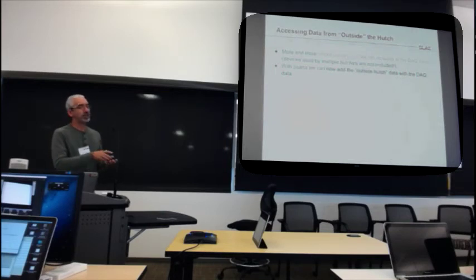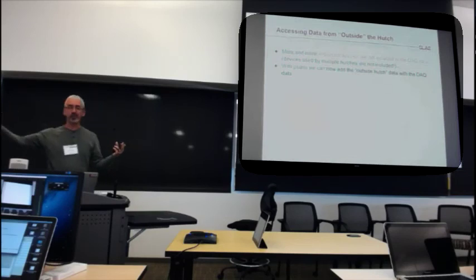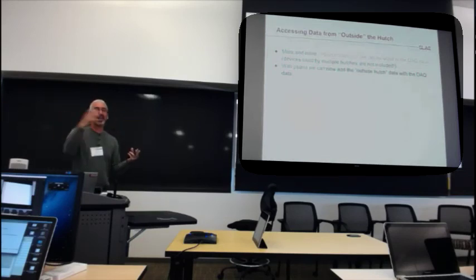This is because the DAQ has to be on this subnet, which is specific to the hutch. I won't bore you too long with the technical details. But there are these devices which need to be used by all the hutches, so they can't be in the subnet, so they can't be part of the DAQ.